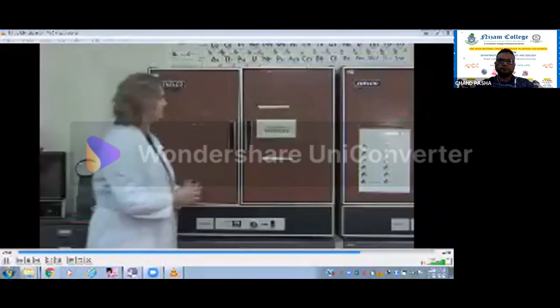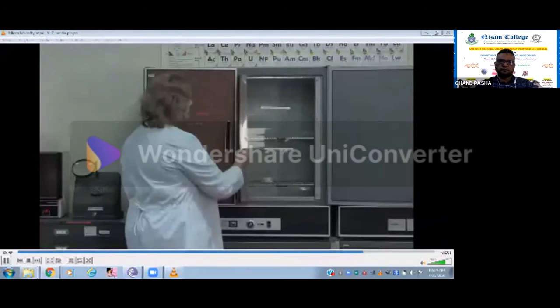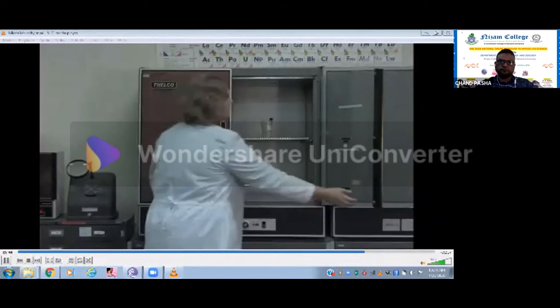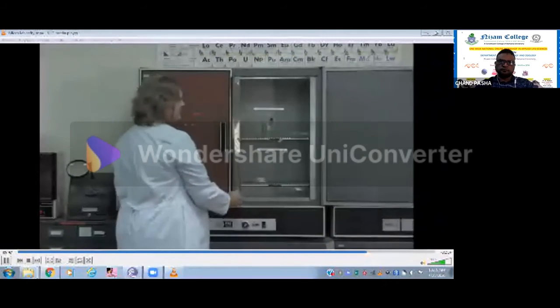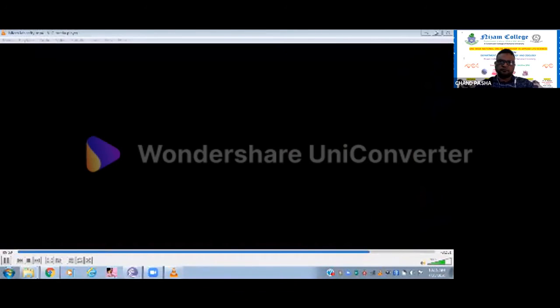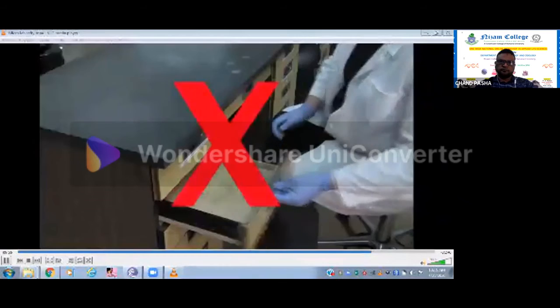Transport tubes and store tubes in incubators, refrigerator, or lab bench in cups or racks. The cups are in a cardboard box on top of the refrigerator. Keep plates in the incubator or refrigerator, an area designated for your class. Do not store microbial plates or cultures in the drawers.